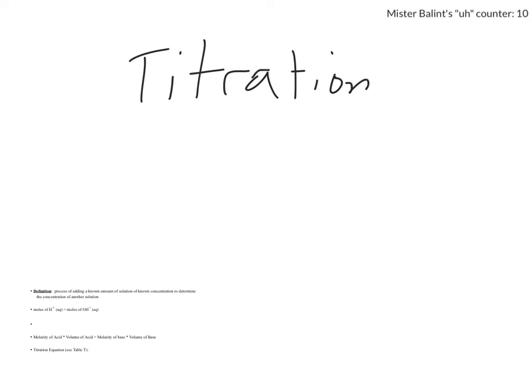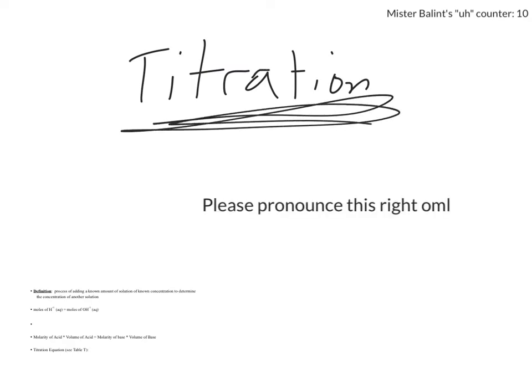The idea here is that what we're going to do is called titration. I can only hope that that's how you pronounced it. Titration, good. Titration. Okay.